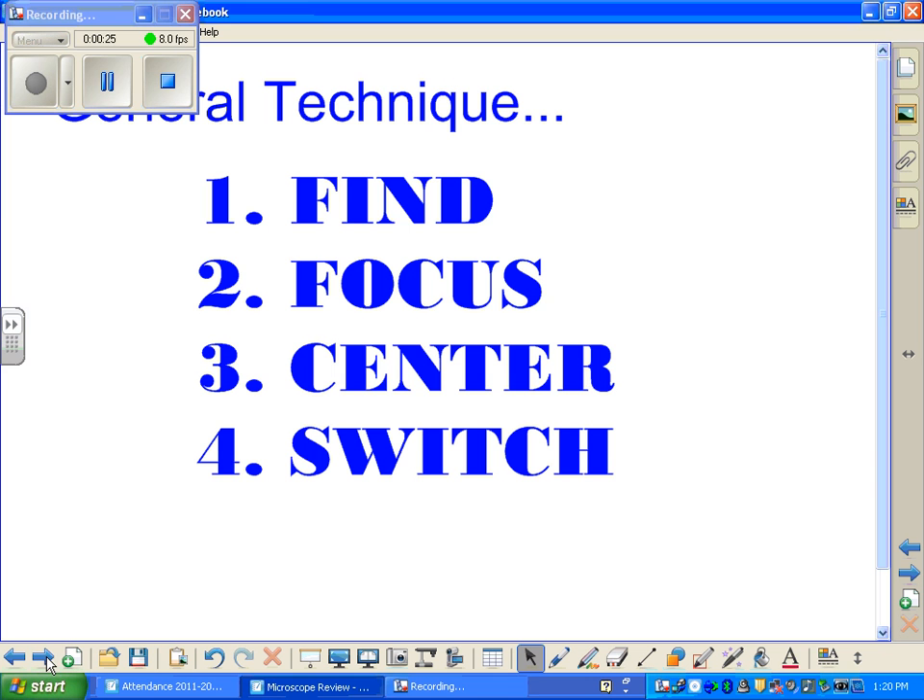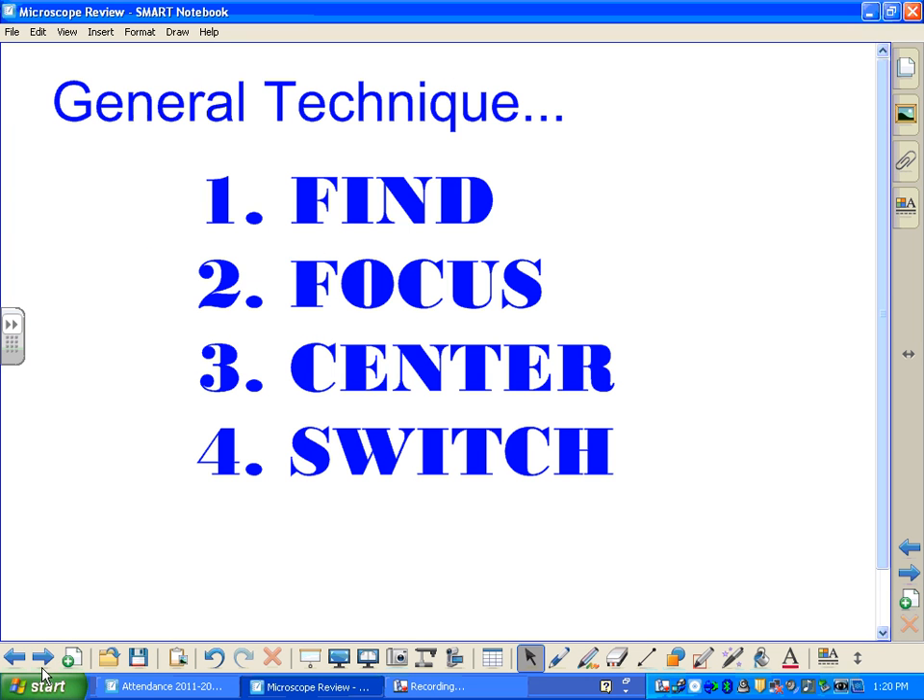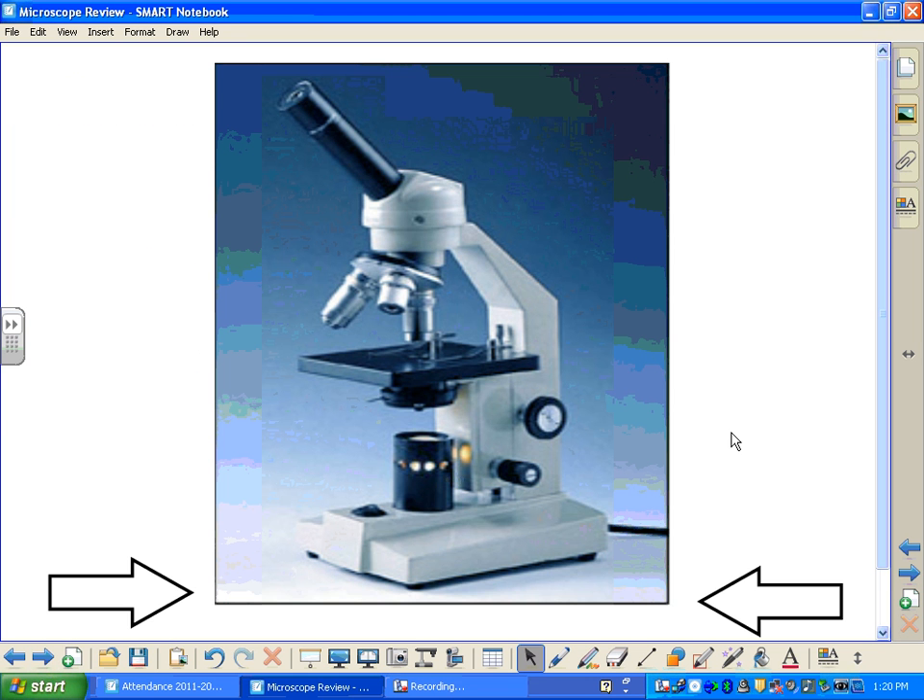Let's start out with the parts of the microscope. Starting up here at the top, this is where you put your eye. This is called the eyepiece.